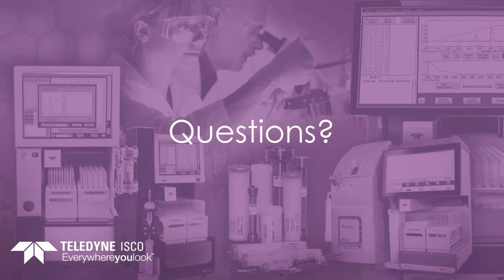Next question is, how does a difference in the back pressure of carbon dioxide in the analytical column affect your prep run? And the answer to that is, it depends on the density of the carbon dioxide. If the back pressure on your analytical system is higher, that means that the carbon dioxide is more dense and compounds can elute a little bit earlier. This means that when we calculate a gradient on the preparative system, we might see a little bit later elution.